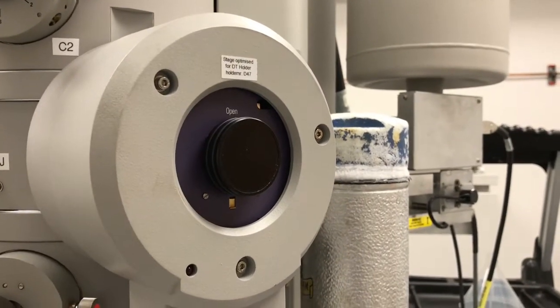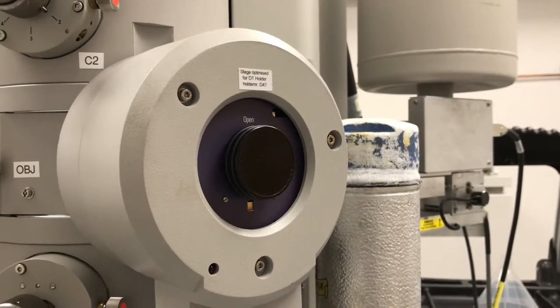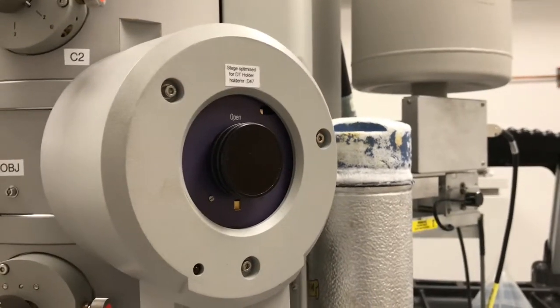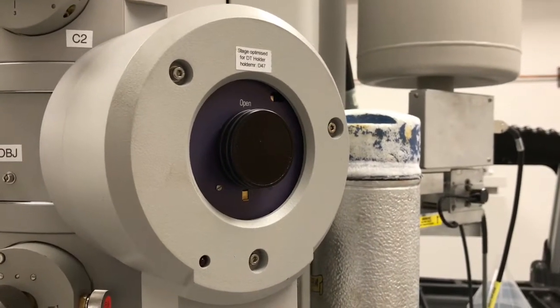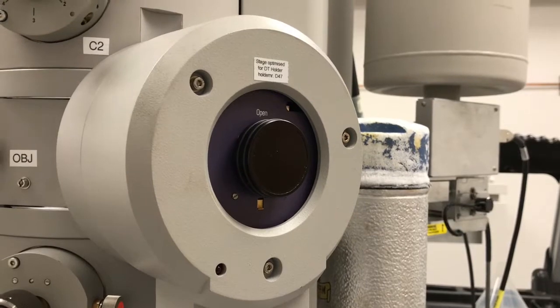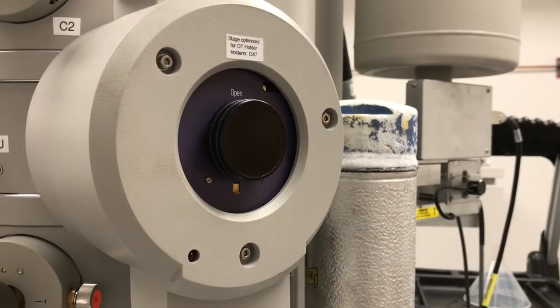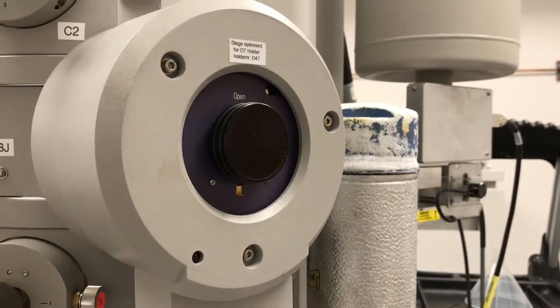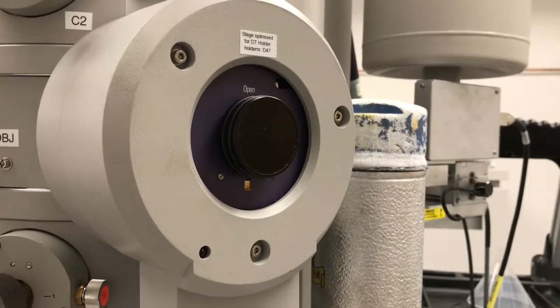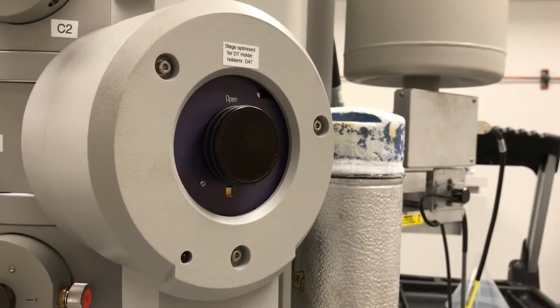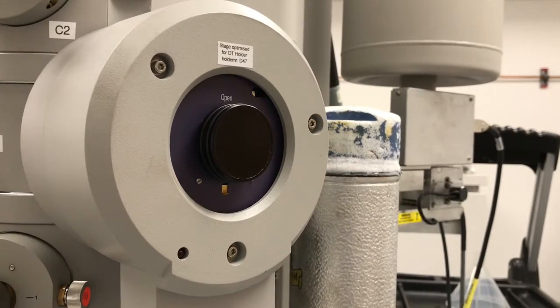We're going to start from the state that we currently have here, which is with the single tilt holder inserted into the column. We're just going to demonstrate this using the single tilt holder. It's essentially no different than if you were using the double tilt holder, but we're going to demonstrate this with a single tilt for purposes of simplicity.